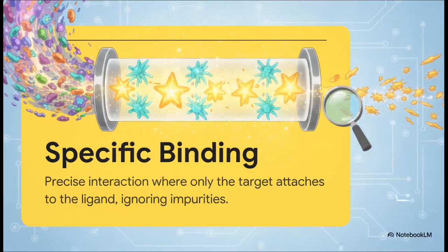Now, step 3 is where the real magic happens, specific binding. While a tremendously complex biological sample flows through the column, those immobilized ligands literally ignore everything except their exact target. Our hero molecule is captured and held incredibly tightly, while all the unwanted cellular debris and impurity molecules simply flow straight past. It's a perfect molecular filter.